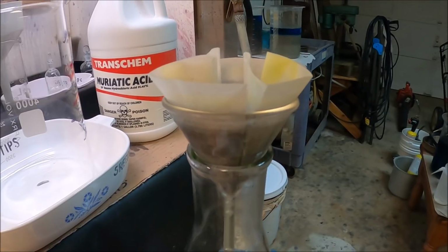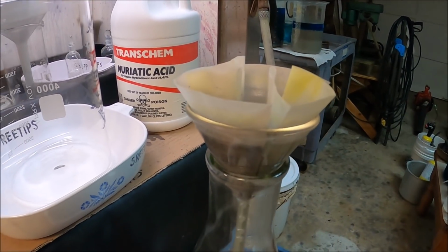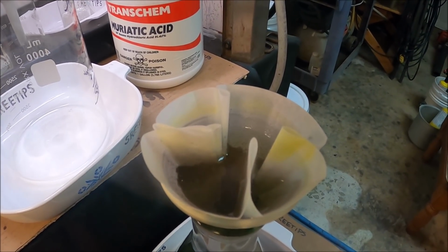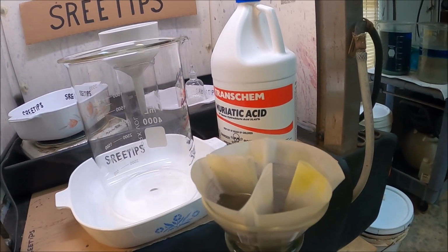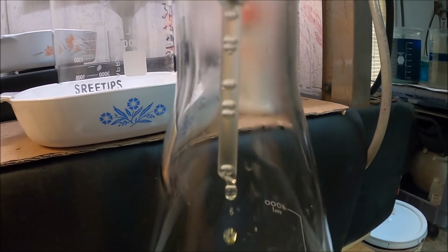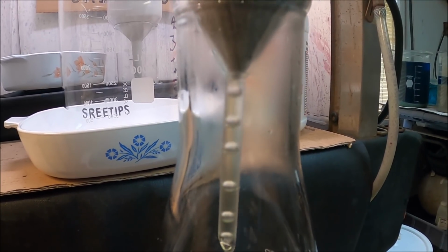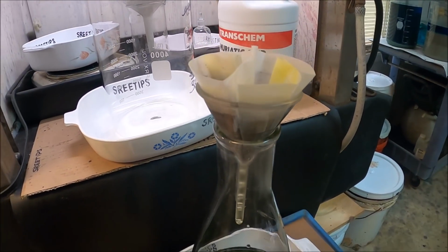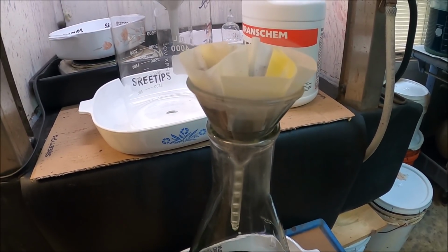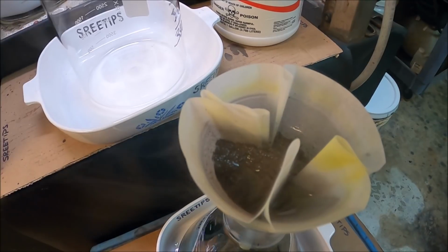Nice quantity of gold here. It's probably gonna be a little bit more than I was expecting. You can see the yellow color on the filter. This is dissolved metals that appear when the hydrochloric acid is added to rinse the gold. The solution coming out of the funnel is a little bit yellow colored. That's dissolved metals being rinsed out of our gold. Like I said, hydrochloric acid does a much better job of rinsing dissolved metals out of our gold powder than just plain water would do for us.